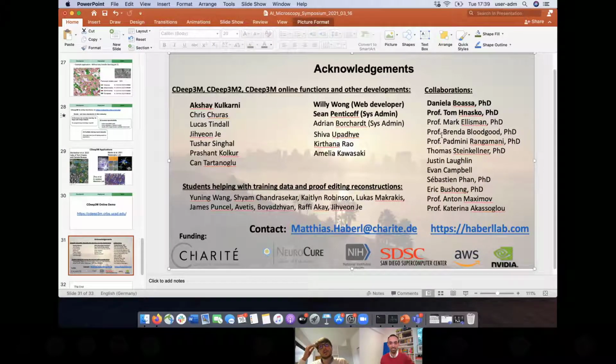Yeah, so I think there are a couple of different directions. Obviously, some people rely on dedicated hardware individually, but when you look at the connectomics field, there was just recently a very interesting paper, and a preprint before, by Sebastian Seung's group that they call ChunkFlow.